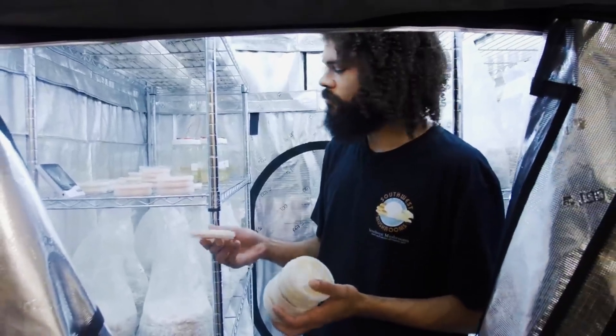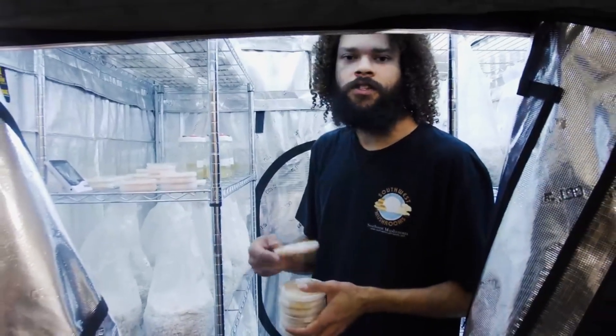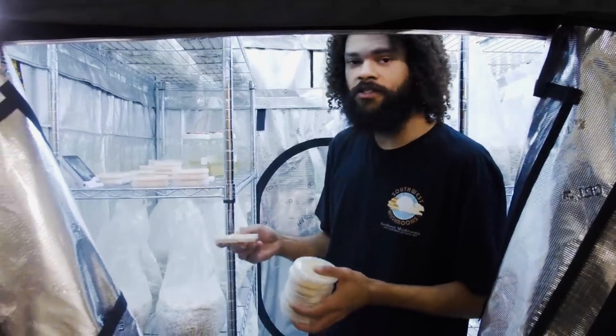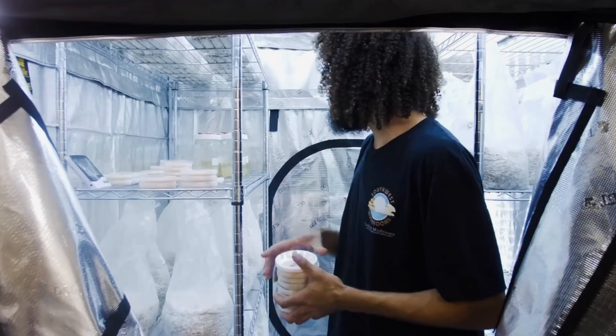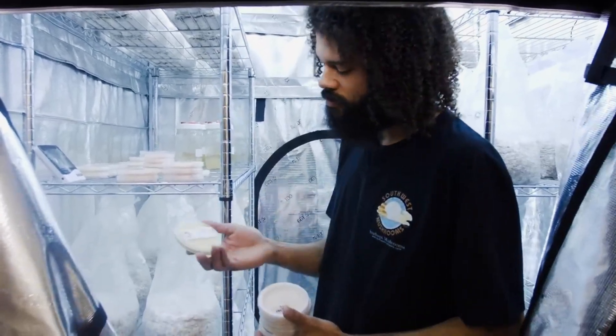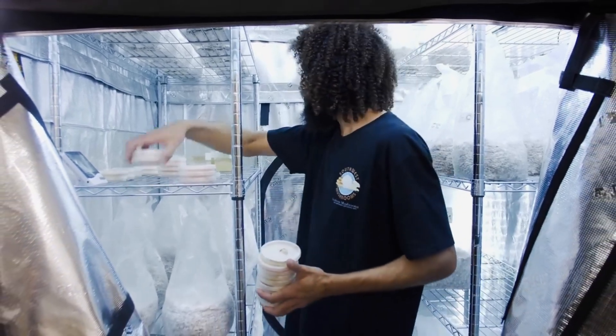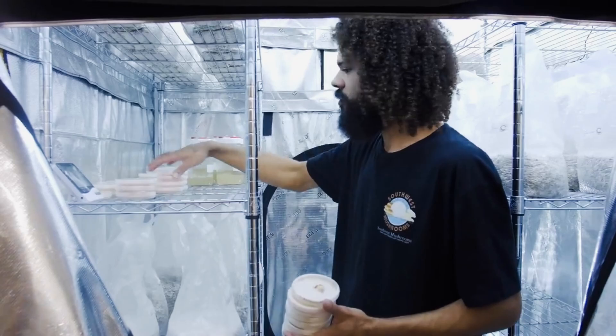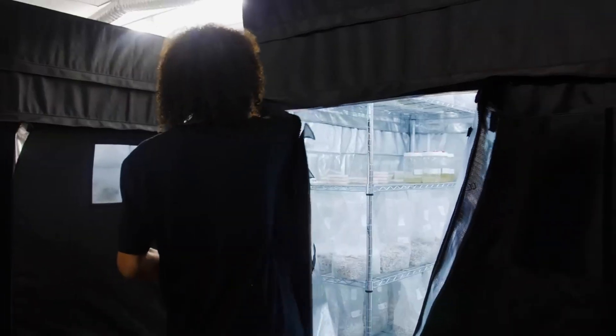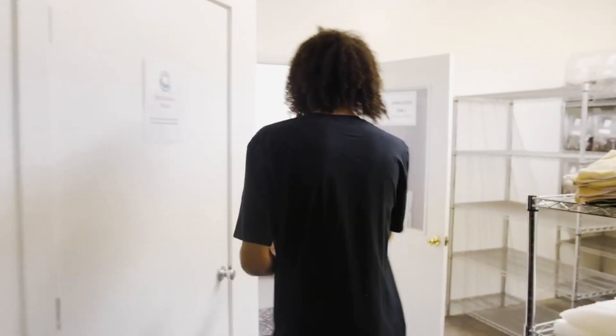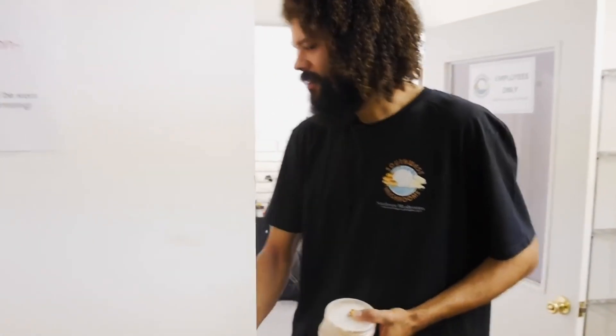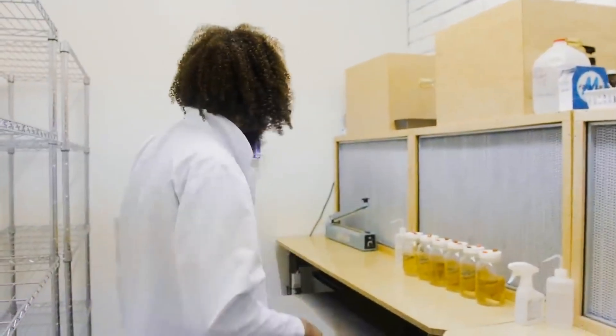I'm constantly having to do tissue transfers to keep the cultures actively growing. So we'll grab one of these - this is a shiitake petri dish. Gonna do some transfers for that today too. I think that's about it for now. Get the flow hoods running.